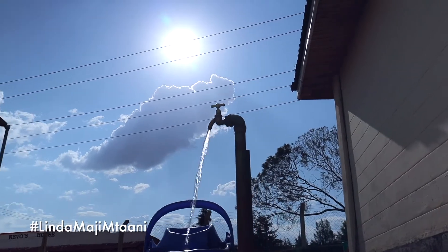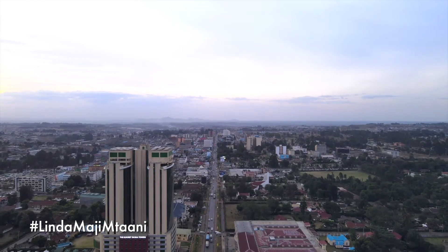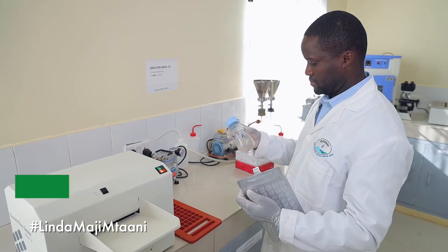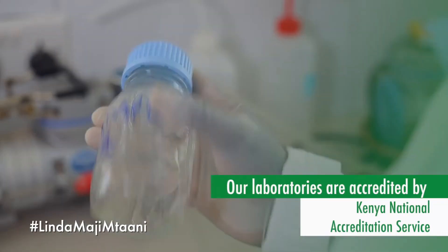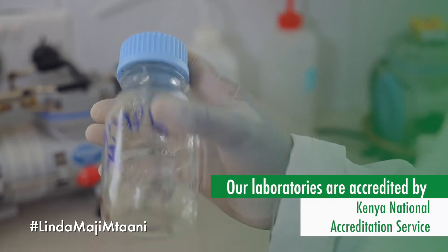Water that is contaminated can impact on the health of the population, keeping in mind that the consumers of our water is about half a million people in Eldoret town and its environs. The company is operating a water testing laboratory that is accredited by Kenya National Accreditation Service.